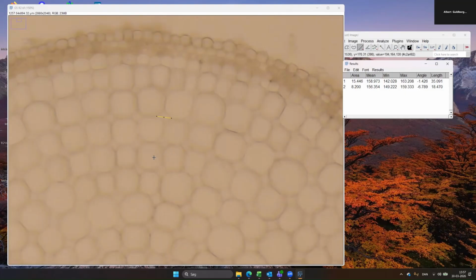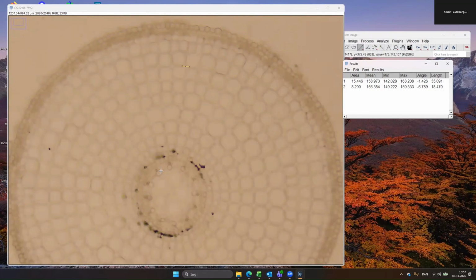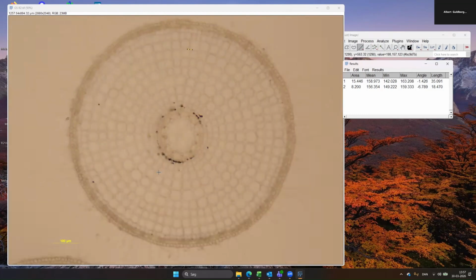Yes, you have to do this 3 times with the 3 random cells, and then you take the average intercellular airspace radius and cell radius.